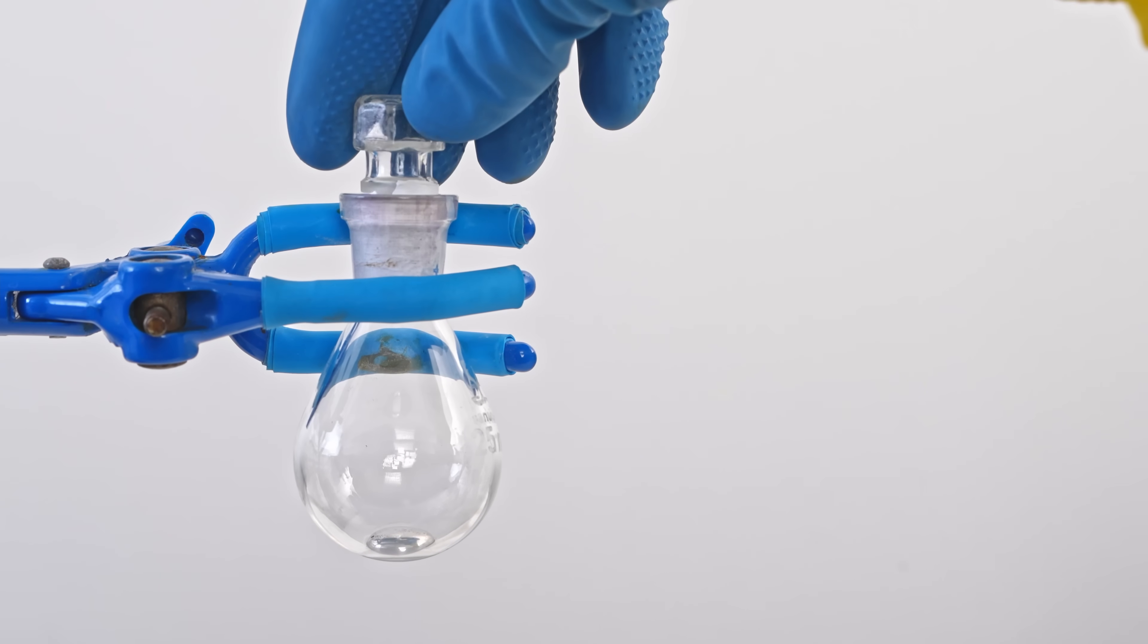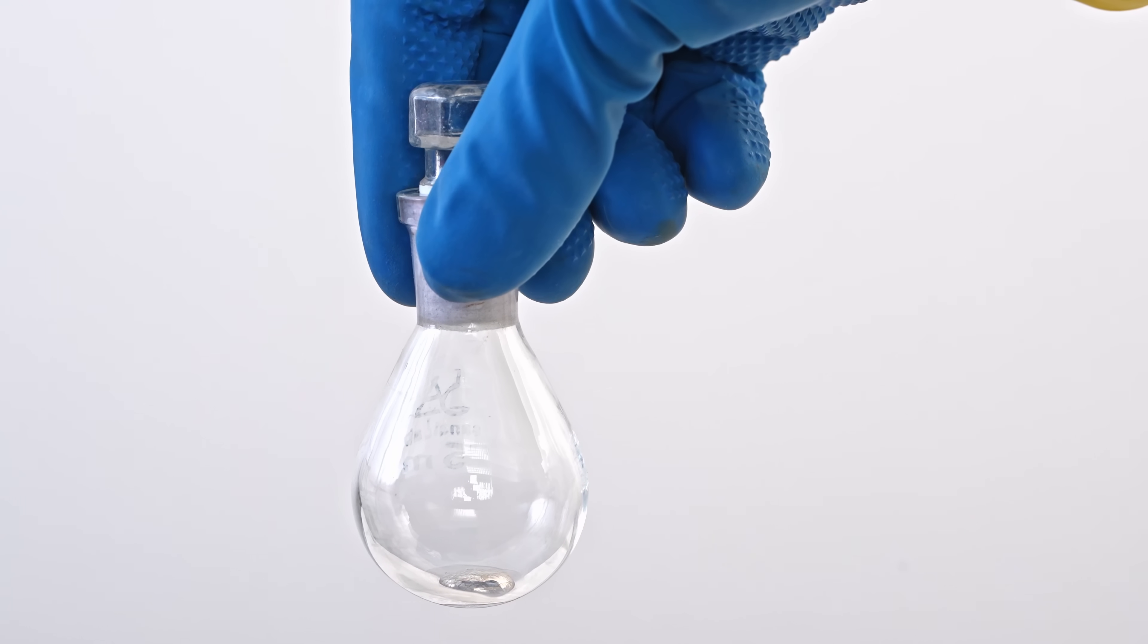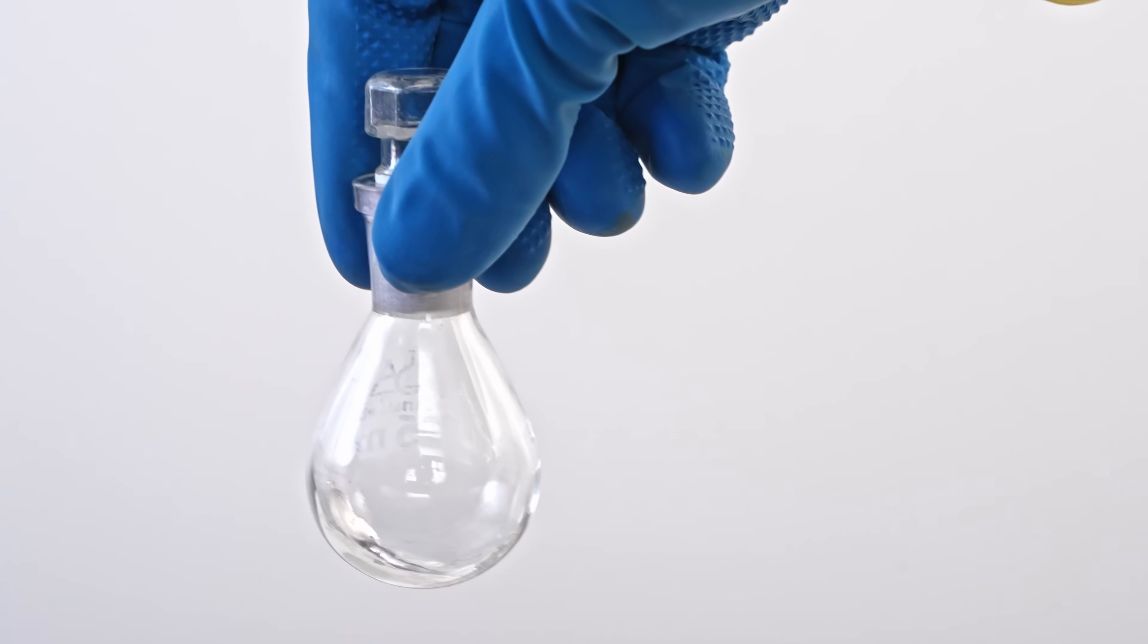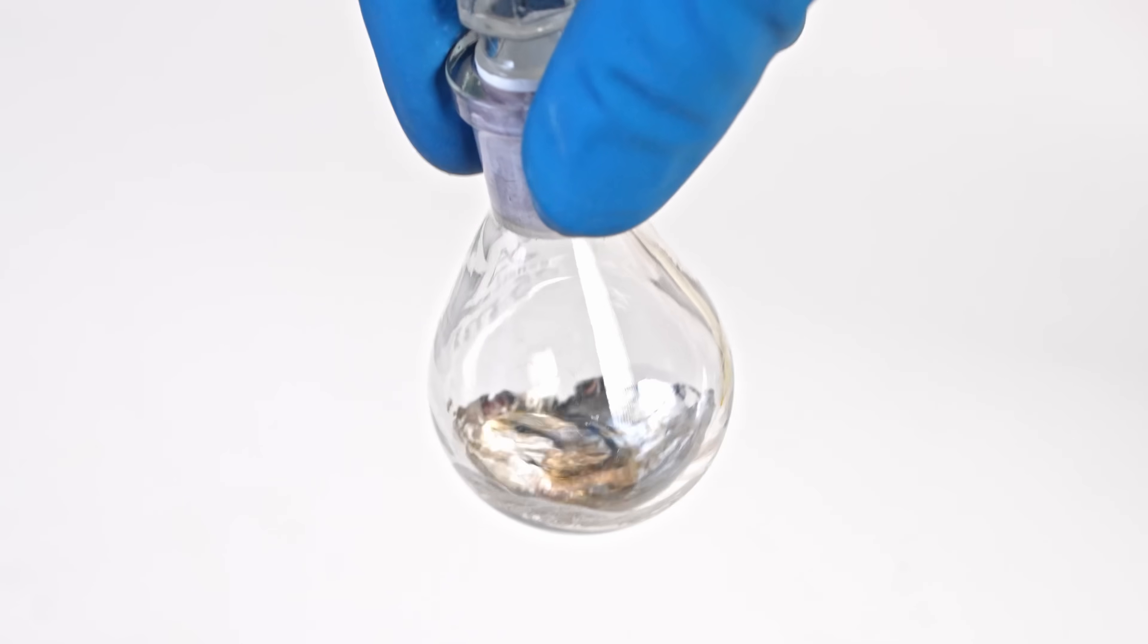Mercury has high surface tension, so it usually forms droplets instead of spreading. But after shaking the flask, the mercury wets the glass, forming a mercury mirror. Why do you think this happens? Let us know in the comments.